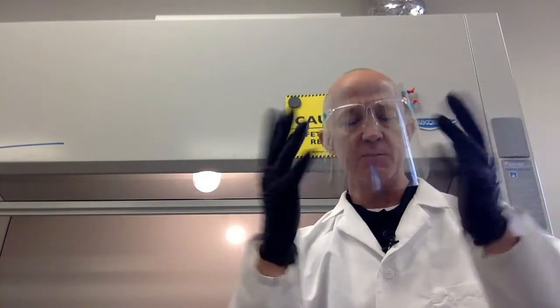As with any lab activity, we want to make sure we are properly protected. We are using sodium hydroxide today, and that's fairly corrosive. So I'm going to use this lab coat to protect me. I'm also going to use a face shield in this case, and finally, gloves to protect my hands.